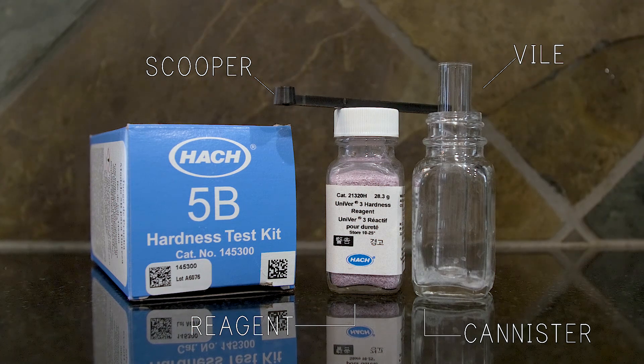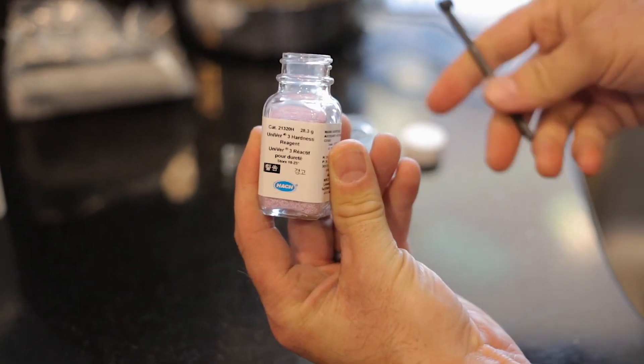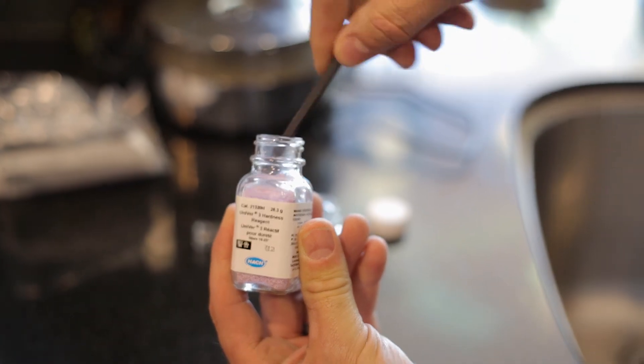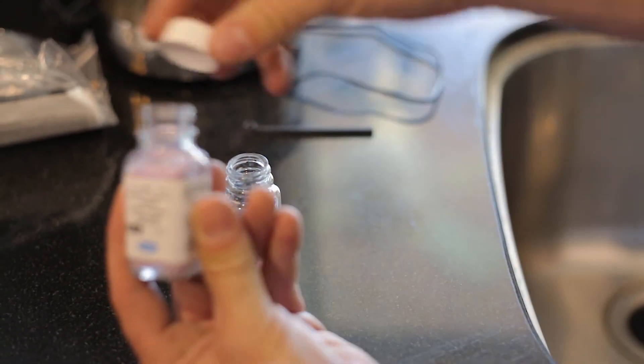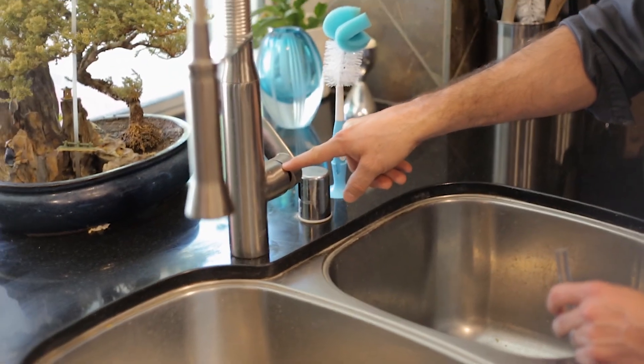So we take our reagent, we take our scooper, and we fill our scooper up with one scoop. We proceed to put it into the jar, and that's all we should need.